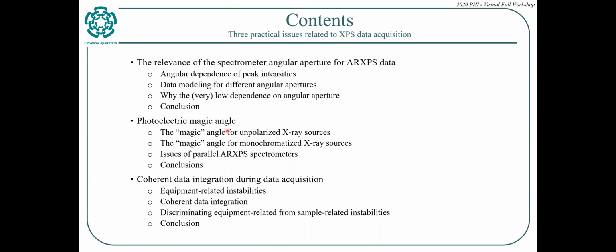These are three different topics. The first one is about the angular aperture for acquisition of angular XPS data. The second is about the magic angle, the photoelectric magic angle. And the third is about how to integrate data during data acquisition.